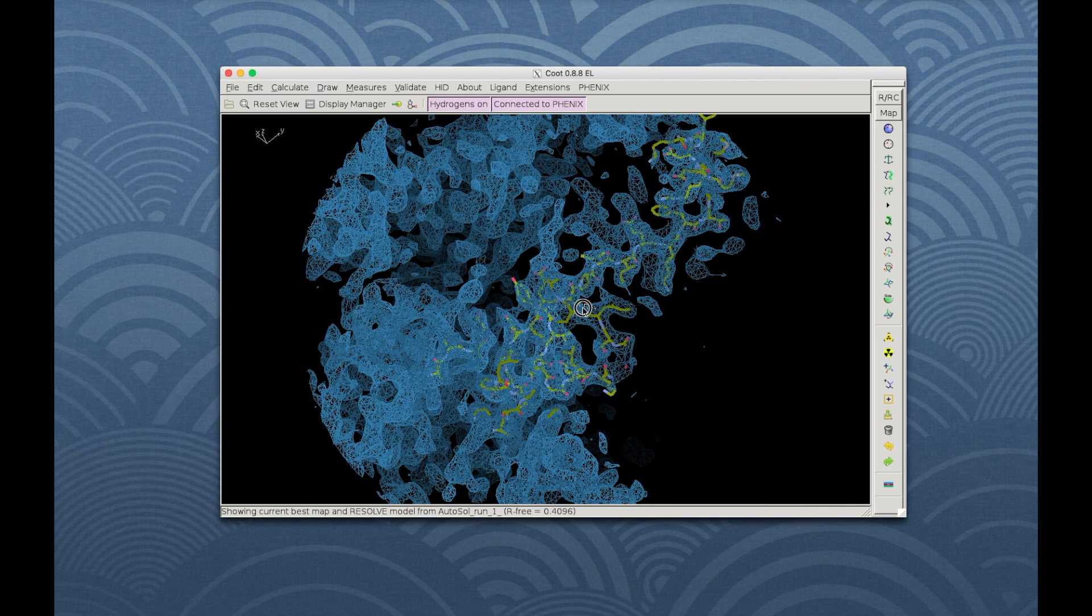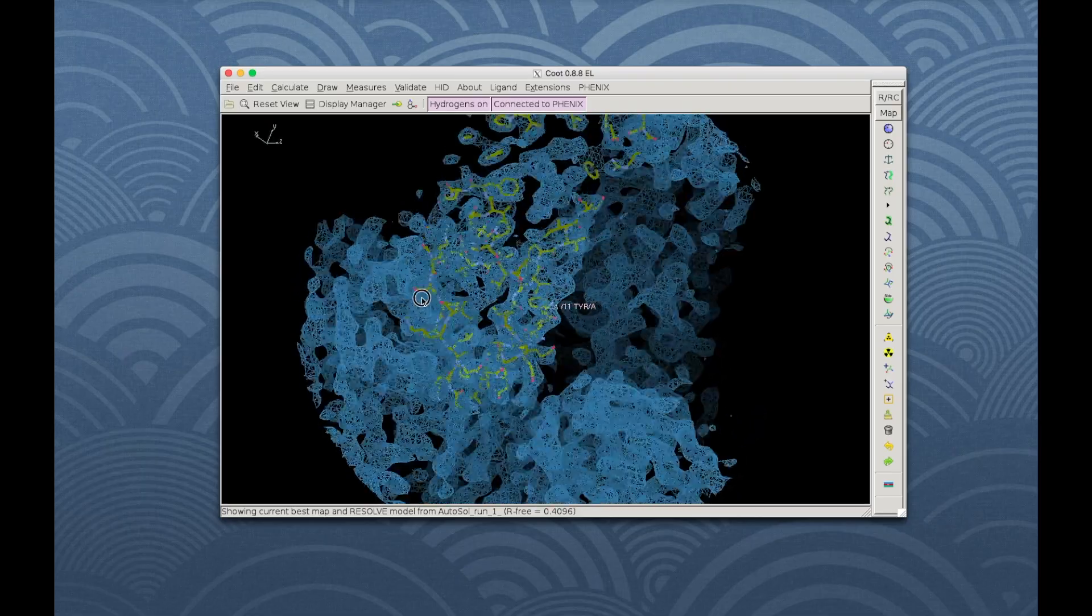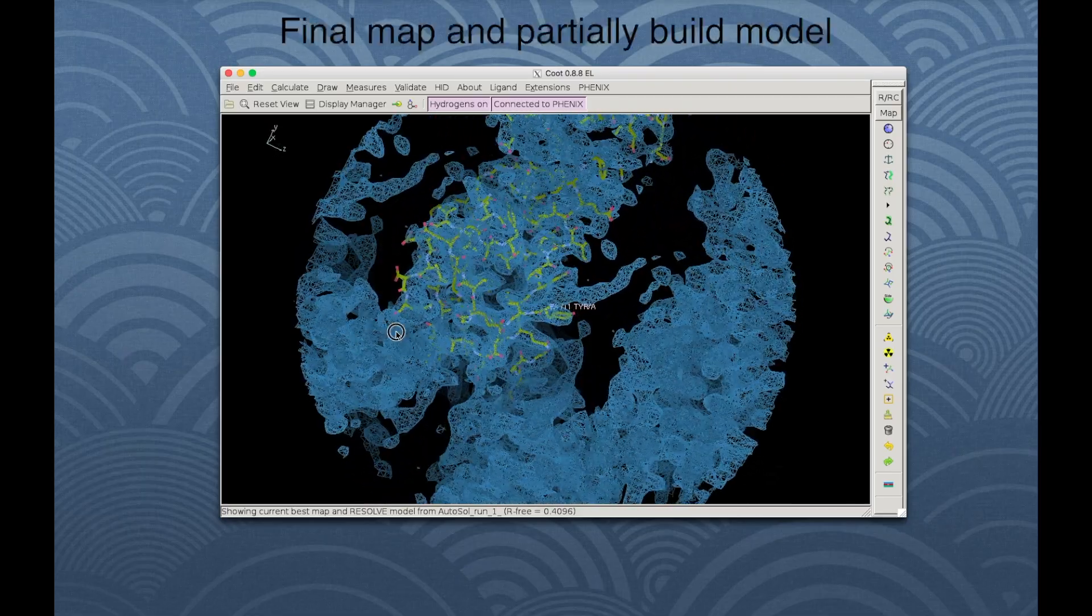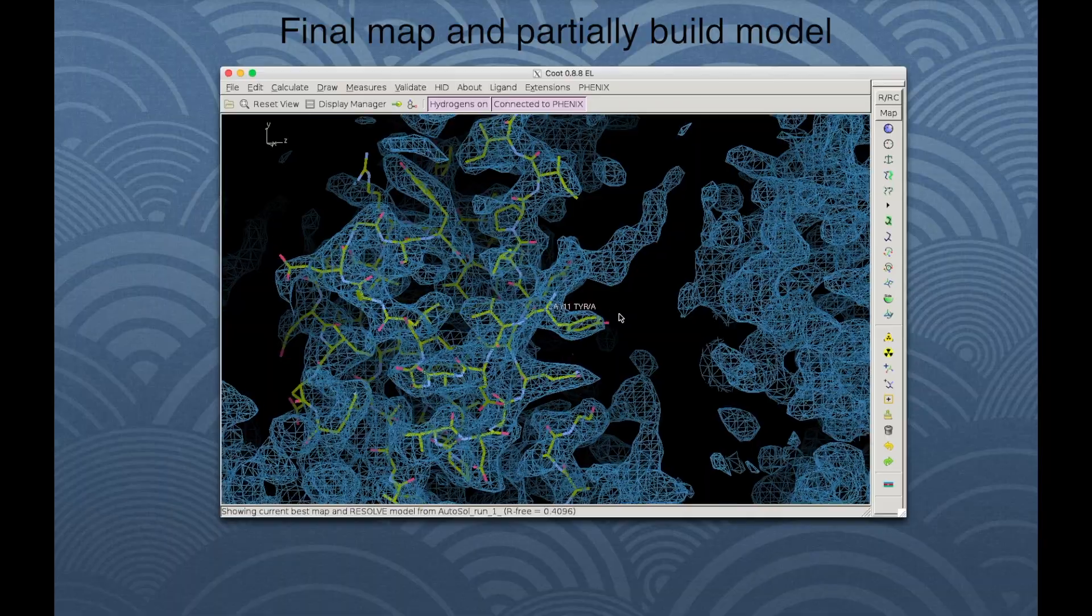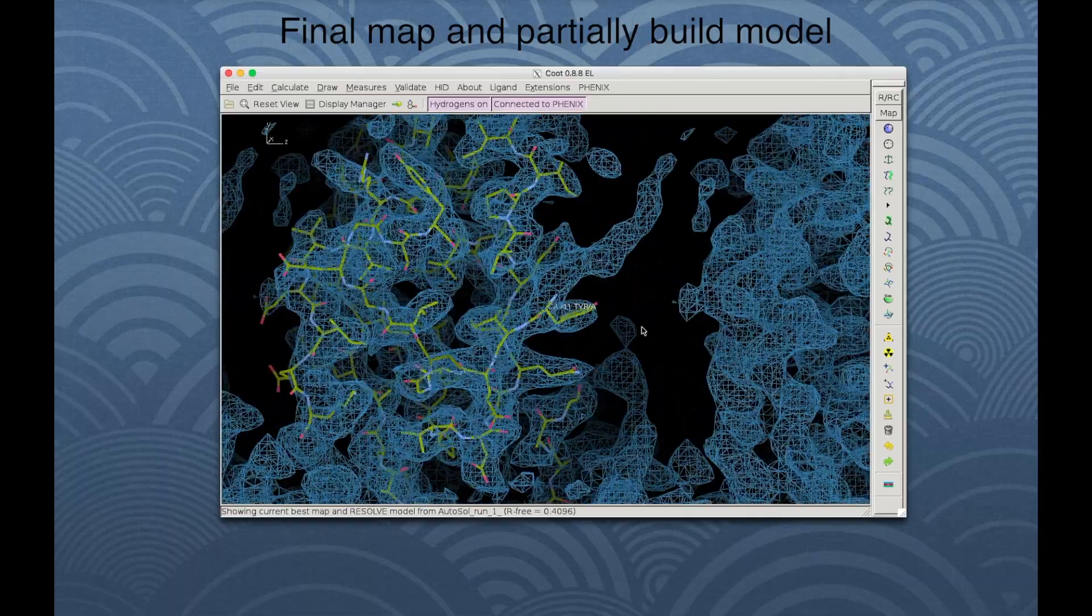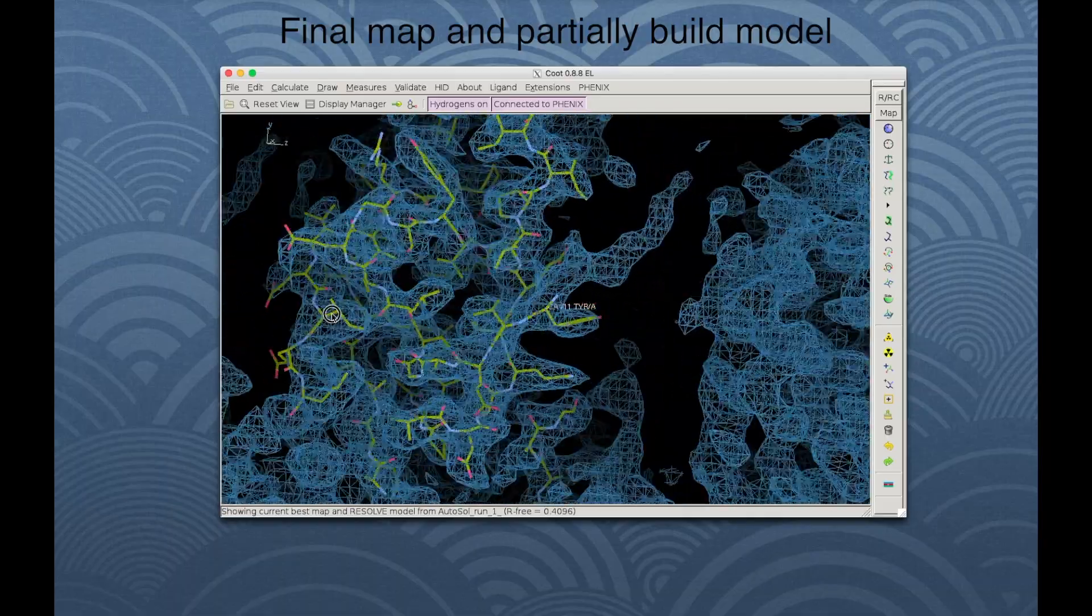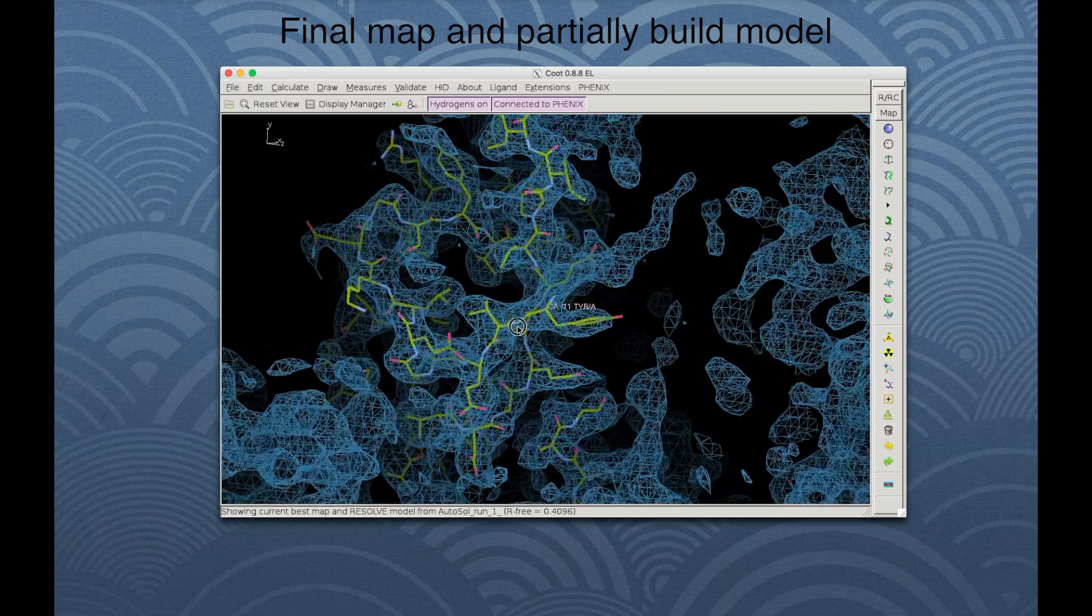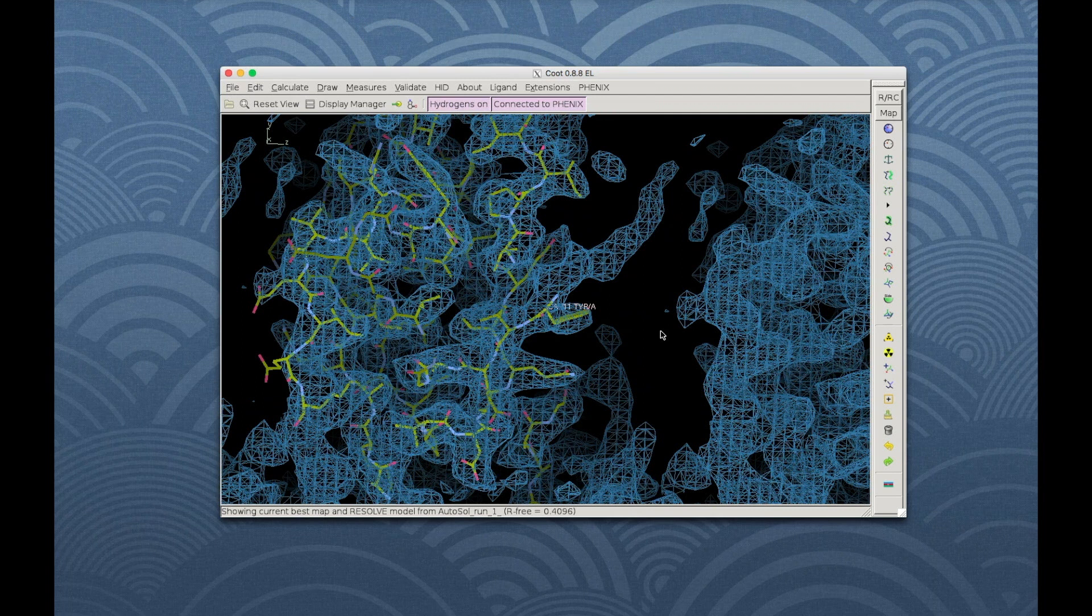This is a very clear map. You can get this sort of result with AutoSol if you have accurately measured high-resolution anomalous data with strong anomalous signal, as in this tutorial dataset. In more challenging cases, the map might be less clear and less model built. Note that the final model from AutoSol is rarely complete and may contain errors.